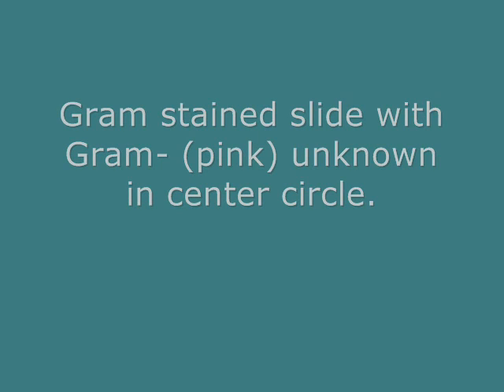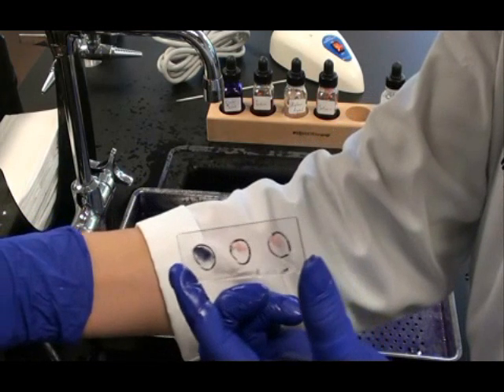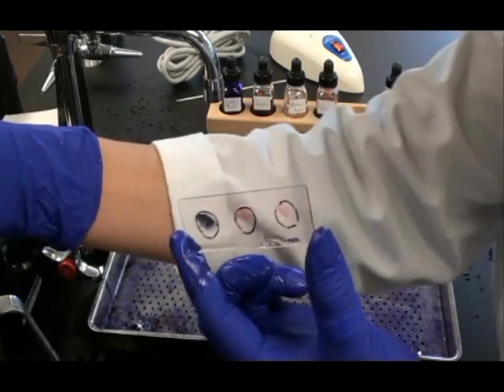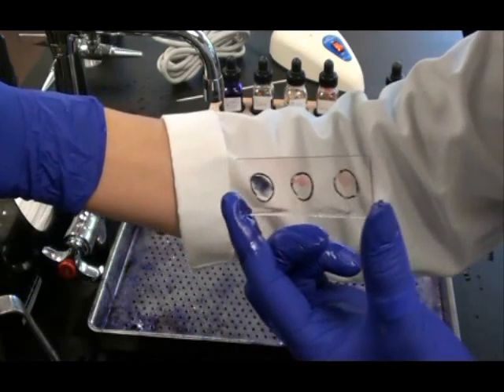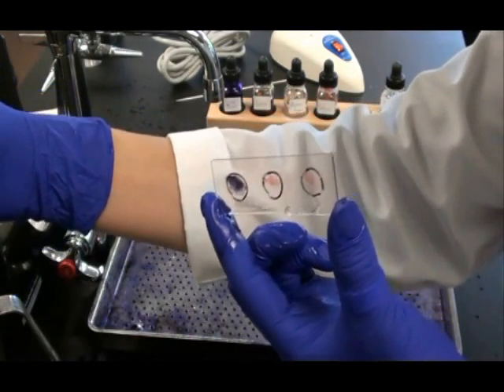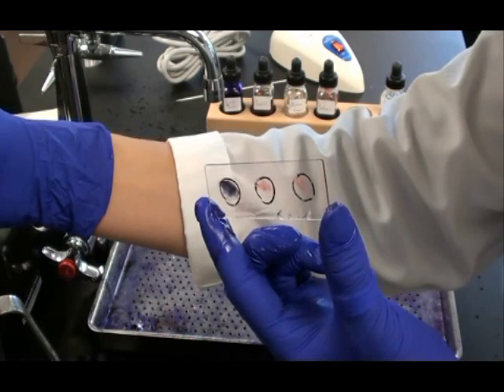The slide I just prepared has a Gram negative unknown. I see my positive control on the left. My negative control on the right. And my unknown in the center is pink like my negative control.